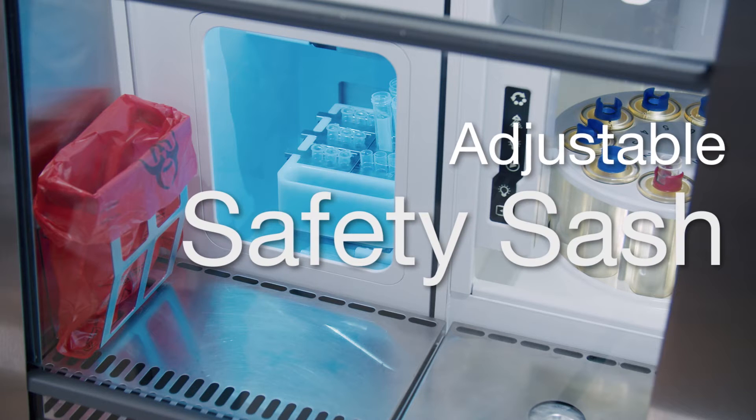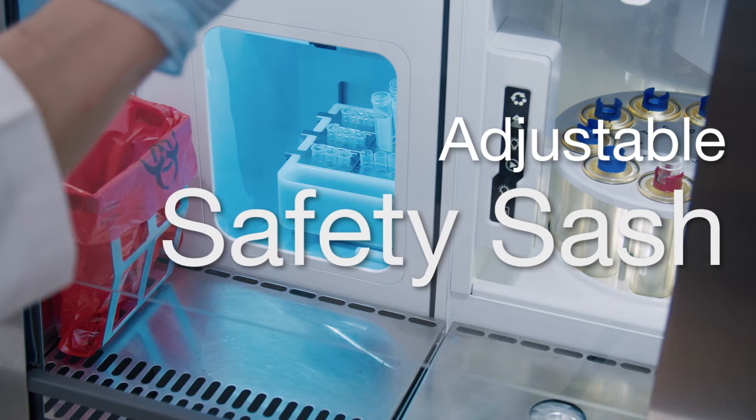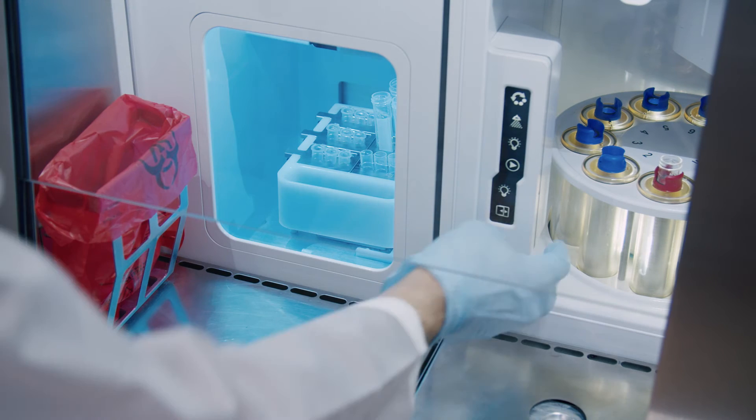The adjustable sash maintains containment while allowing easy access to the nozzle and sample sort areas, providing constant user protection.